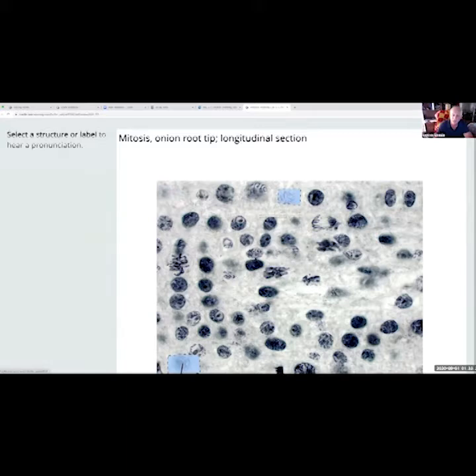So again, if we go back, where was our interphase? Okay. So this one here is interphase. It's set up a little bit different. I'm just trying to get the blue to go away. So here's your interphase. You can see right there, everything's just all inside the cell. The cell's just working. Nothing's organized here.